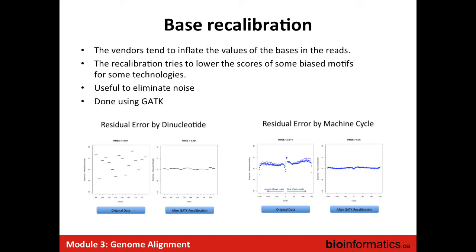Now, if we talk about human genomes, the new version of the human genome has been made, the HG38, and they added a lot of haplotypes, especially for the HLA region. I think they added a hundred or a few hundred haplotypes for the HLA sequence. That's really a big issue for the aligner. Because if I align my read there, it will see, oh, I can map on the basic haplotype, but I can also map on many other haplotypes. So we will mark it with a mapping quality of zero, because it has equal chance to map at different locations.